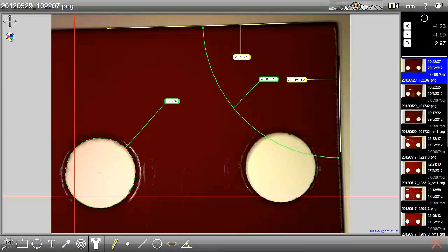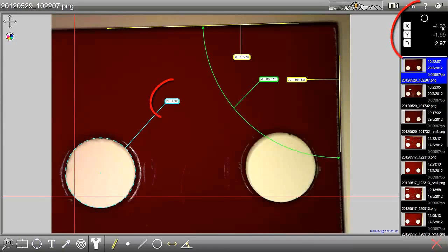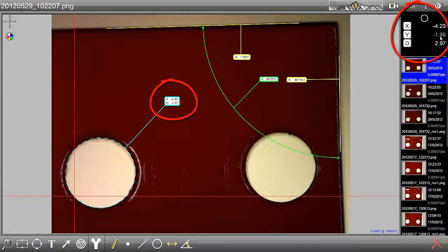As you can see, now this is done, it shows you the size of the circle. And you can see here its diameter. If you look up here, you can see the x and y coordinates of the circle if required.